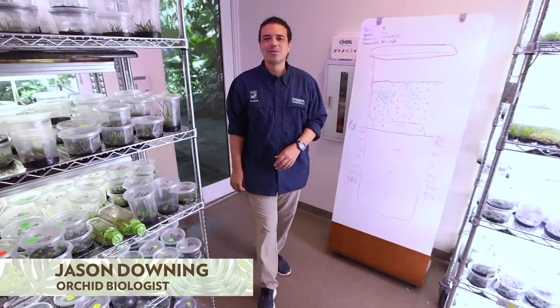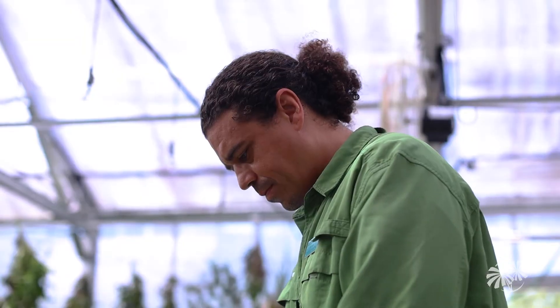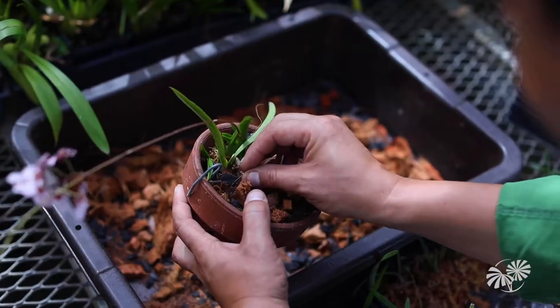This is the micropropagation laboratory at Fairchild Garden. This is where all of the propagation starts for the Million Orchid Project.